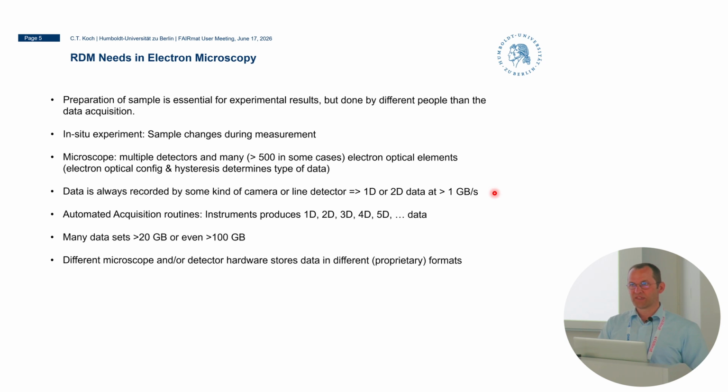Right, but something that is probably often not specific to our case is this last point here, that all these different instruments store the data in different formats. So you have everything from text to proprietary binary formats that nobody really knows how to interpret unless somebody does reverse engineering, but this is only about 95%. There are still some unsolved mystery bytes in there and so on.